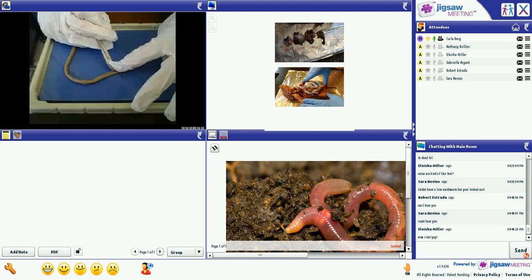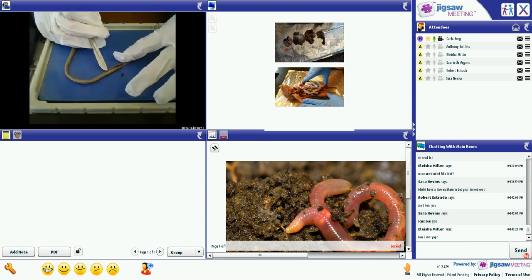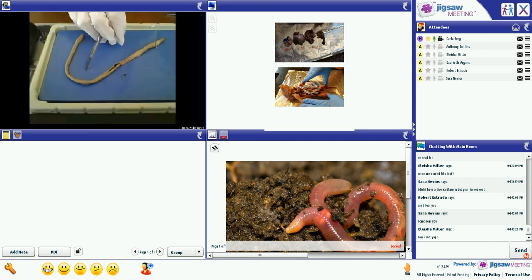Okay, but when you open it up, that's what you will see. And if you can peel it back a little bit, you have cut through the muscle and the tissue. Go ahead and do that on your worm, please.